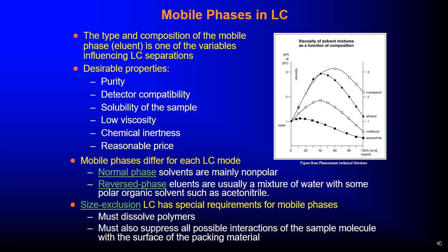For size exclusion, liquid chromatography has special requirements for mobile phases. It must dissolve the polymers, must also suppress all possible interactions of the sample molecules with the surface of the packing material. So very important, very important.